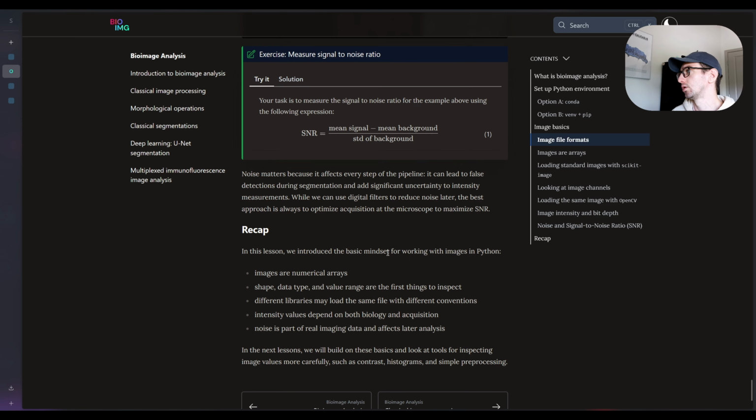We have just 6 lectures according to the timetable, so it's supposed to be a short, fast course. But in the end, the idea is that we will want to measure the features in our images and be able to analyze, clusterize, and perform some of the typical single cell style techniques to analyze the image that we had in the beginning.